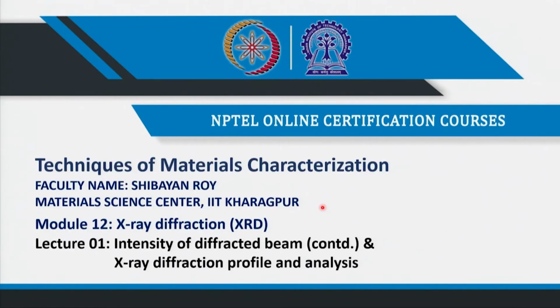a discussion about X-ray diffraction from a real specimen, how to analyze that, and how to get information out of the regular X-ray pattern which you normally use to see the XRD profile. So, how to analyze that profile and how it looks, all of this we will be discussing in this module basically.